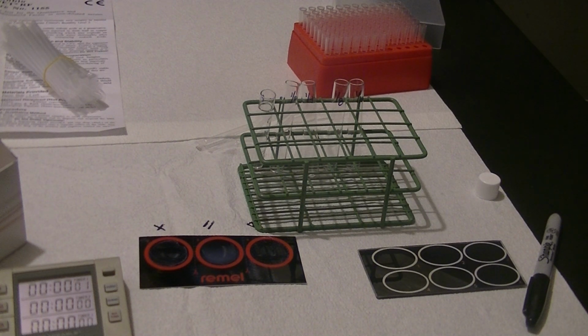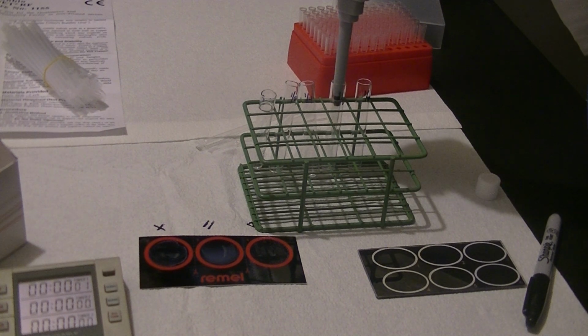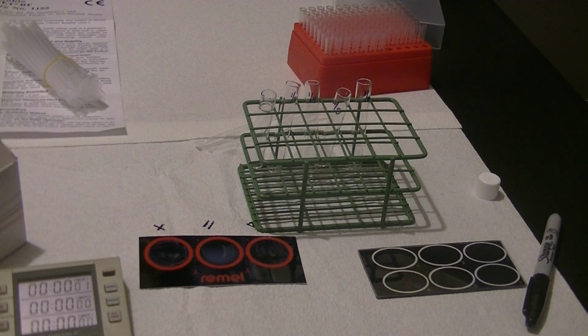Just like the serial dilutions that we performed in the tubes yesterday, you can go ahead and add your diluent to the tube ahead of time, because the same amount of diluent is going to be needed for each of these dilutions.